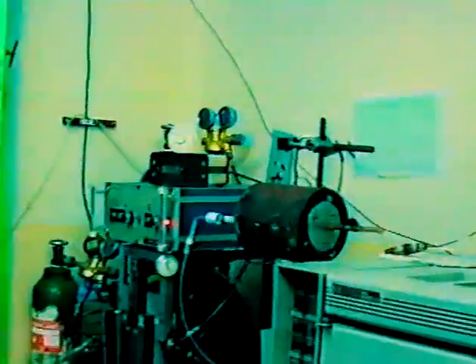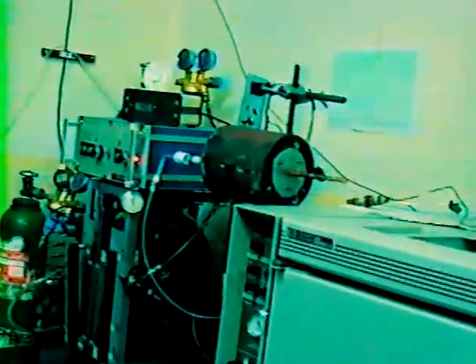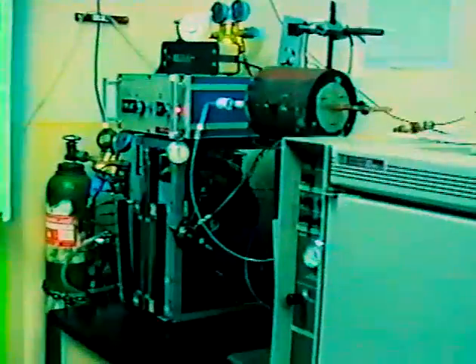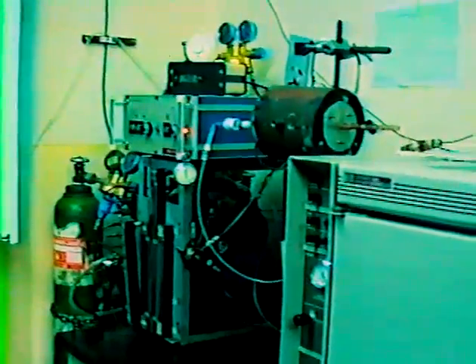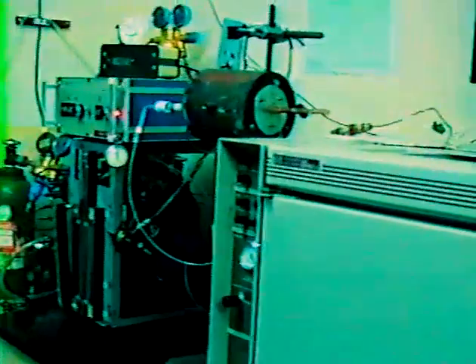And here my colleague is investigating the methane transformation reactions. That means methane decomposition on different silica-supported noble metals. Sometimes he is using a methane-carbon dioxide mixture to investigate what happens on the surface or in this catalytic reaction using this gas mixture. It's a fantastic, very sophisticated machine, so everything can be made in there.